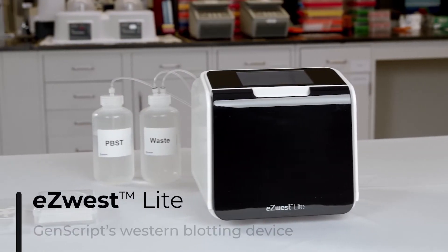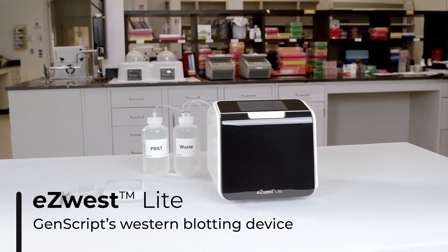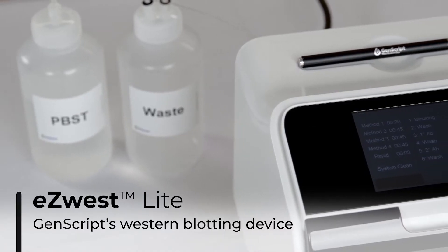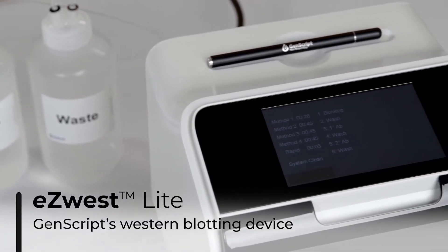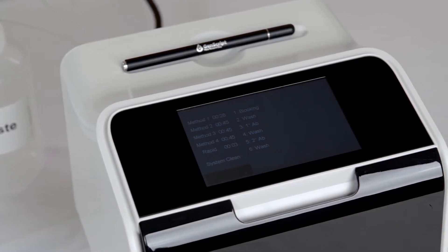Revolutionize your Western workflow with EZ-West Lite, GenScript's Western blotting device that automatically completes the process of blocking, antibody incubation, and washing steps.